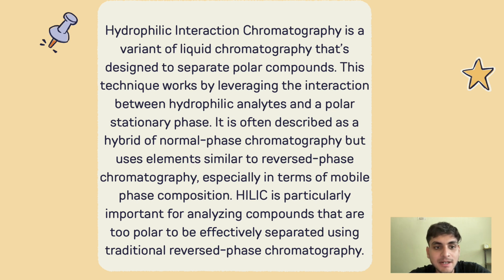It is often described as a hybrid of normal phase chromatography but uses elements similar to reversed phase chromatography, especially in terms of mobile phase composition. HILIC is particularly important for analyzing compounds that are too polar to be effectively separated using traditional reversed phase chromatography.